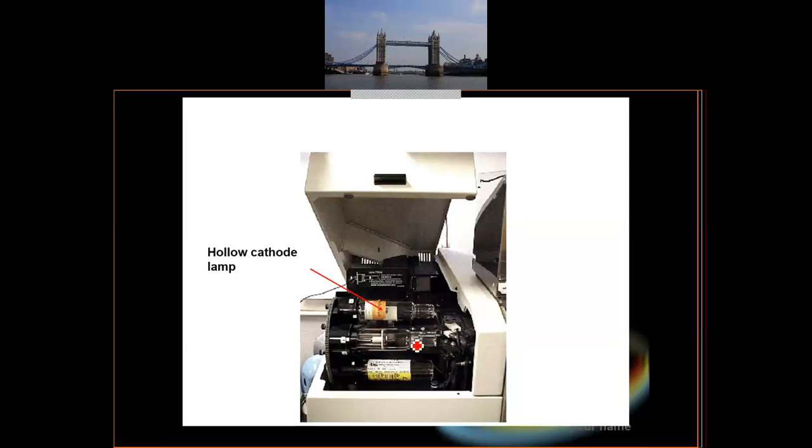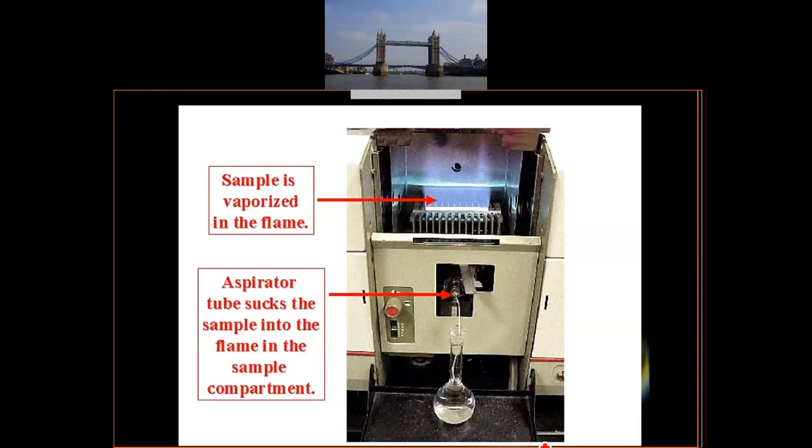This is the one similar to what we have. Okay, similar to what we have. All this light, it's like a revolver. Okay, a Glock, a revolver, pistol, snap pistol kan peluru dia. Bila kita petik picu dia akan bergerak kan, peluru dia bergerak. Ni sama lah, dia boleh bergerak. Okay. If we want to use this lamp, so it will be up here. If we want this one, we press on one of the keys and then it will move up to there.